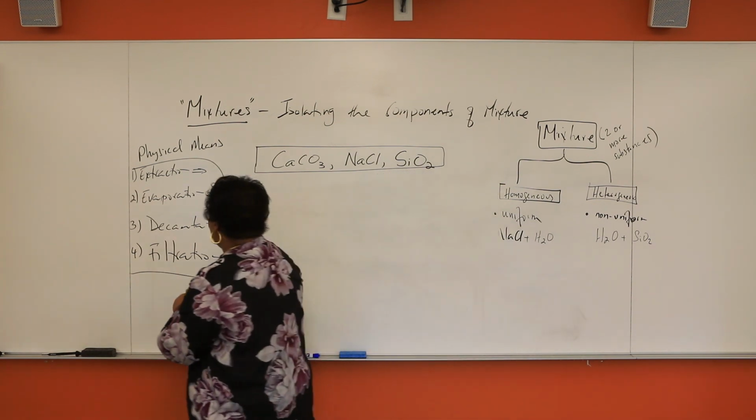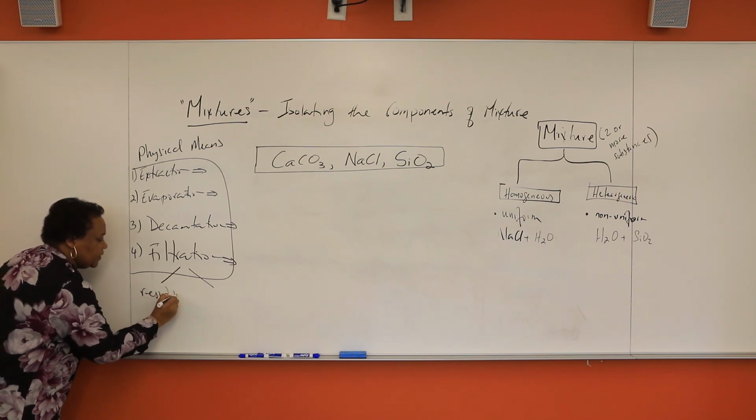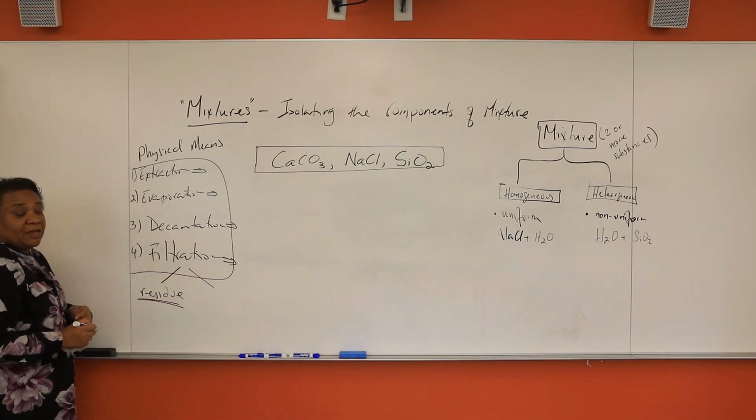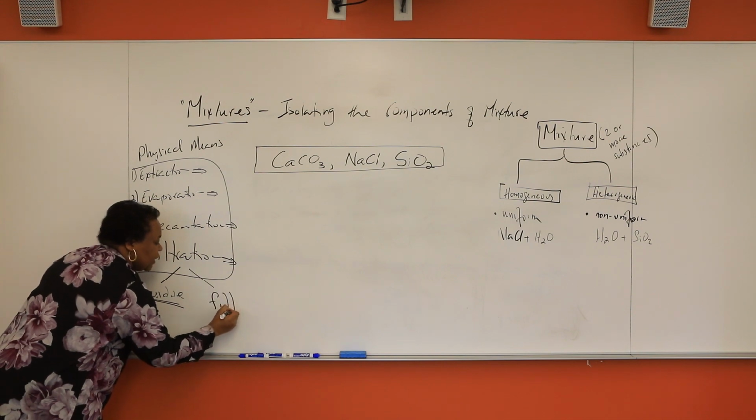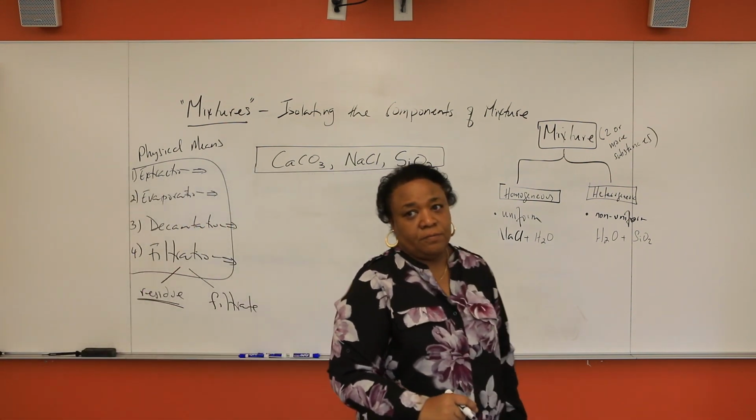Don't forget, I'm going to be talking about a few terms here. You'll hear me mention the term residue. This is the material that remains on that filter paper. The filtrate is the solution that goes through that paper.